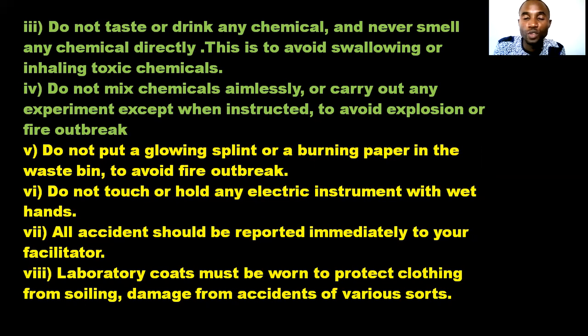All right. Do not taste or drink any chemical, because they are not food. And never smell any chemical directly. Rather, we use this way: when you bring the chemical beside you, you do this way, and as you do it, your hand will perceive it. This is to avoid swallowing or inhaling toxic chemicals.